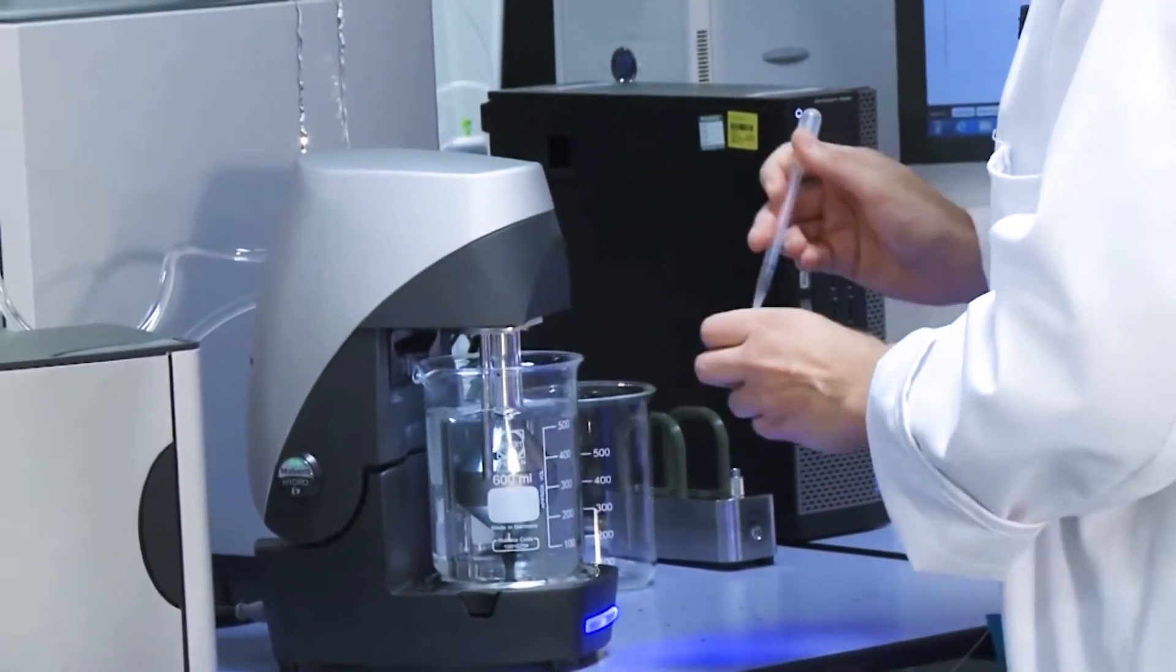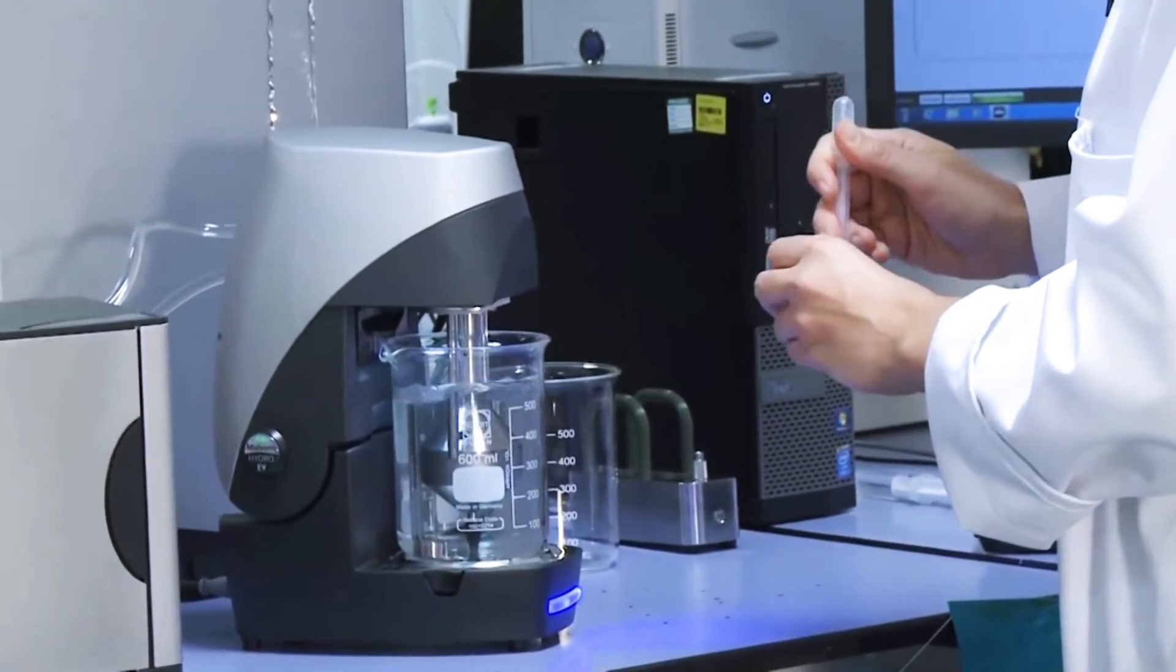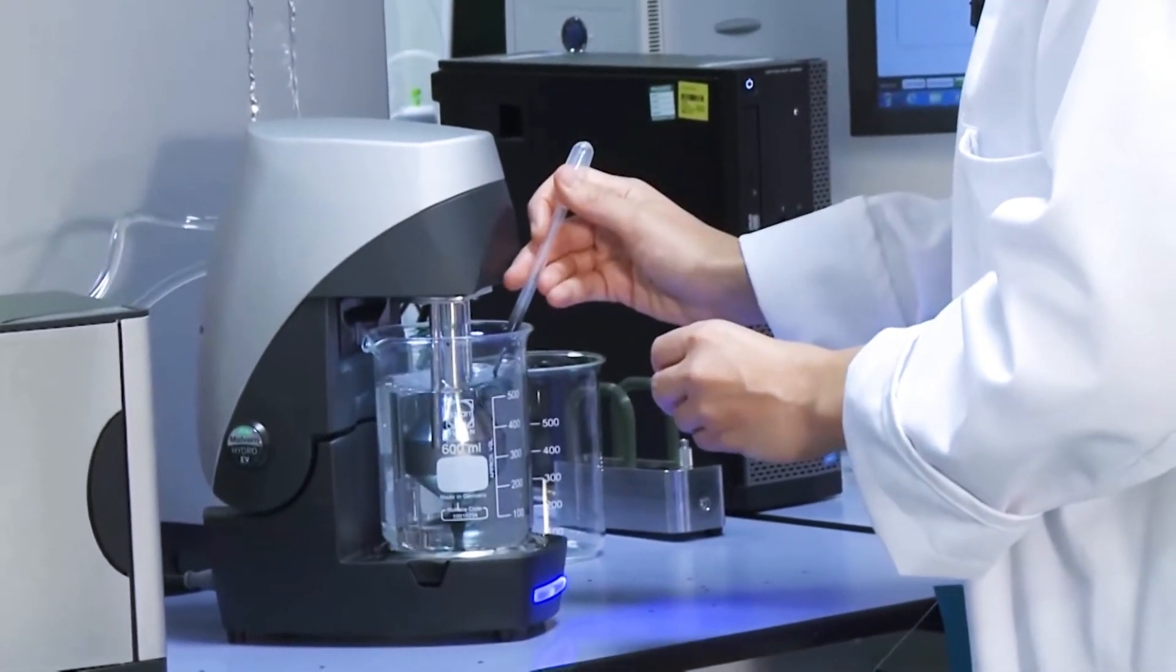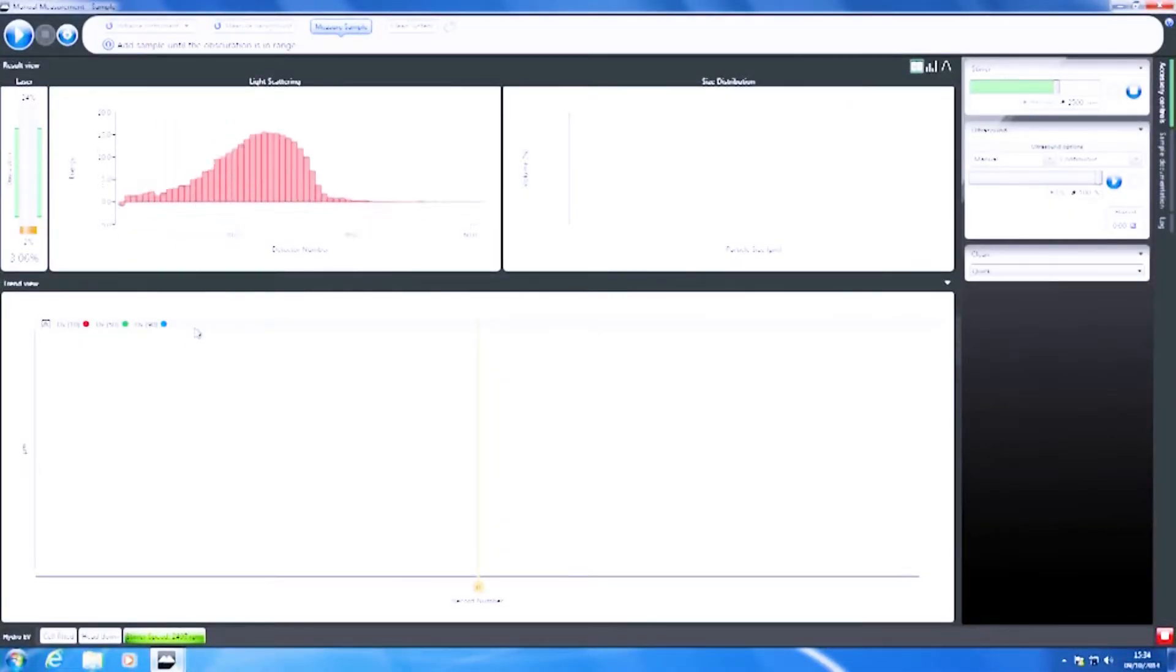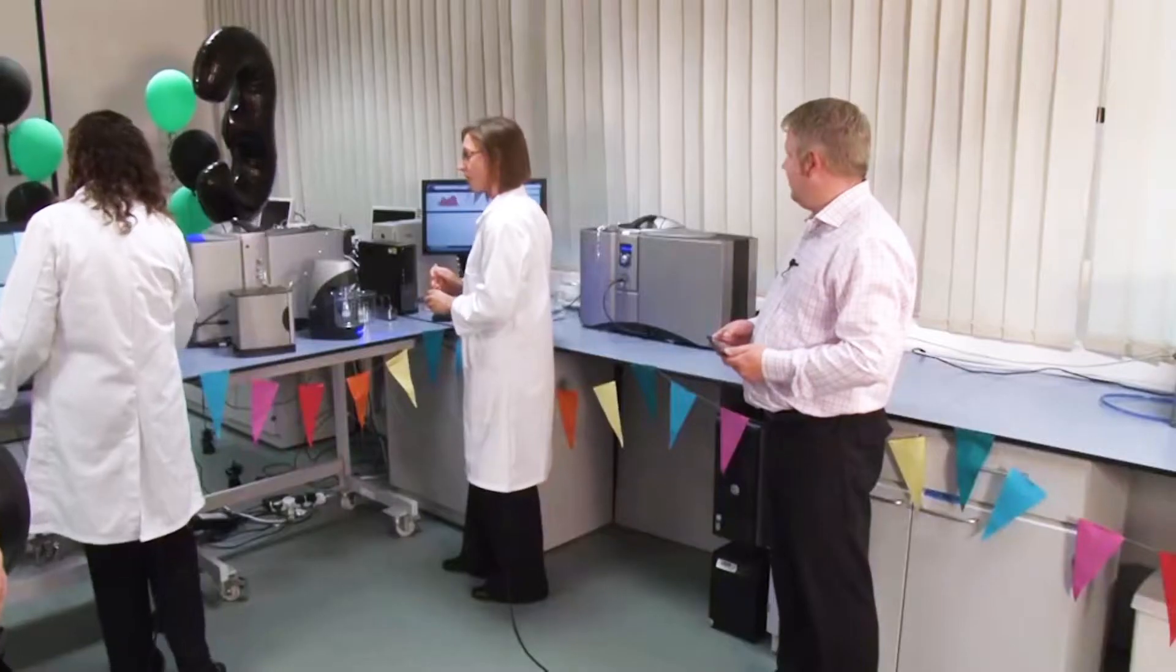So I'm just adding some sample in here and we'll have a look at what obscuration we get up to. So I'll just pop a little bit more sample in there. So when I look at this I think we've got some large particles present. What do you see on the HydraSight?